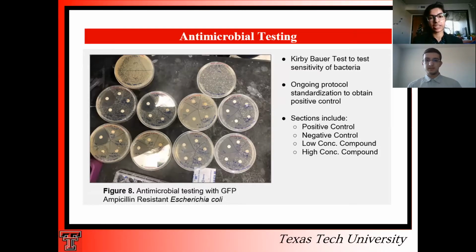Like Dzmitry said, we are still in the process of analyzing our compounds and detecting their purity. So right now, we haven't actually been using our synthesized compounds for our antimicrobial testing. What we've more so been working on is refining the protocol and replicating the antimicrobial testing protocol that we've seen in literature. We've been using the Kirby-Bauer test, which is normally used to test sensitivity of bacteria to various compounds. Right now, we're trying to standardize the protocol and find a working positive control.